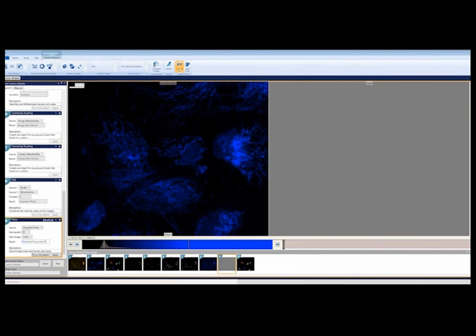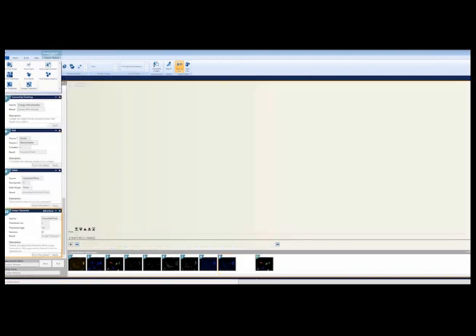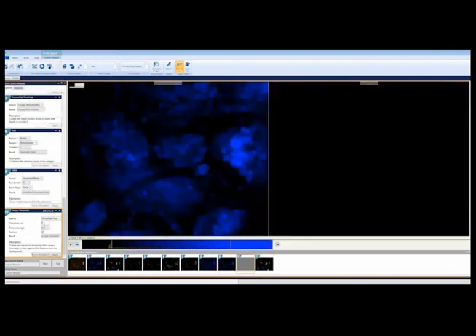How you do this is dependent a lot on the quality of your images. For this set, we can use a simple threshold, but there are other options to get the complex shape that you may need. What is important here is to get all the pixels that you care about, not necessarily to split the individual cells yet.